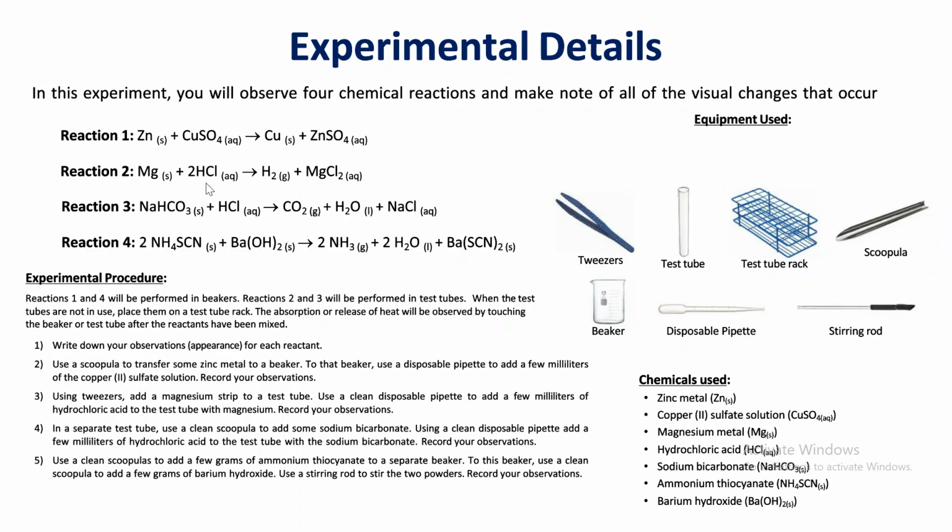And then we're going to add some HCl, hydrochloric acid, to it. Now notice we are predicting that this will be a double replacement reaction. The Na is going to pair up with the Cl, giving us NaCl, and the H is going to pair up with the HCO3, giving us H2CO3. But notice H2CO3 is very unstable. Once it goes into water, it will break down even more to carbon dioxide and H2O, and carbon dioxide will leave the system. And this leaving of the system is what drives this reaction to completion.